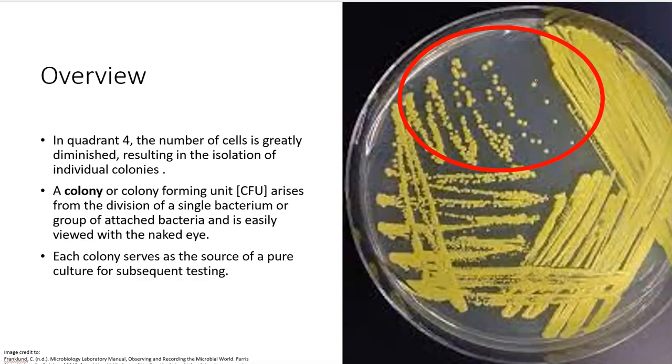So kind of step one of being a microbiologist is being able to master the streak plate technique. Because in order to do all the other tests that you do in microbiology, the stains and the media tests, you have to have a bacterial sample. And to get a bacterial sample, you have to have a nice isolated colony to pull from. And to get a nice isolated colony, you have to master the streak plate technique.